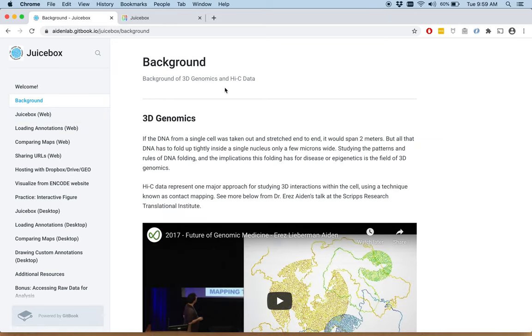We won't go too much into background here, but I do encourage you to watch Professor Aiden's talk on this background tab. He explains the HI-C experiment in depth and how we have used contact maps visualized through JuiceBox to make important discoveries.